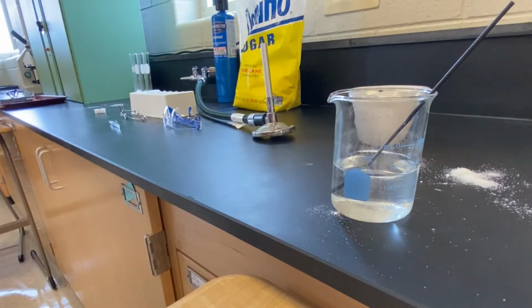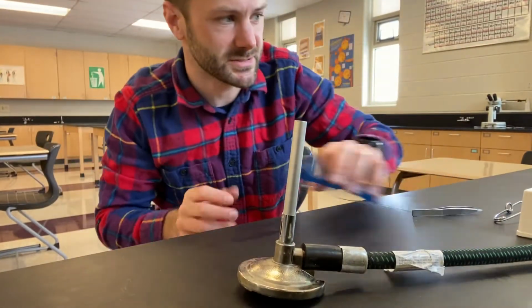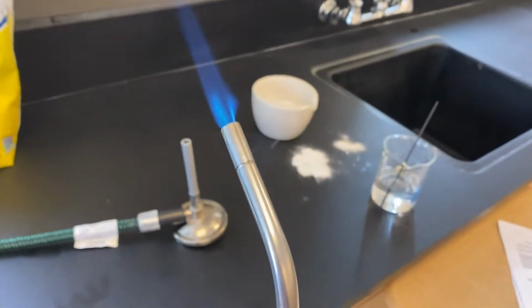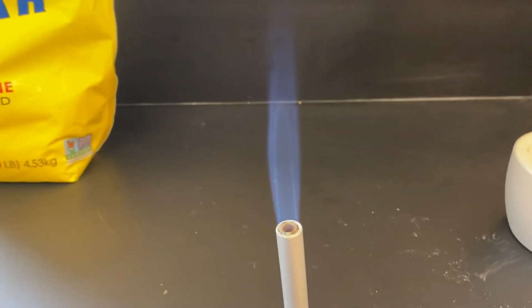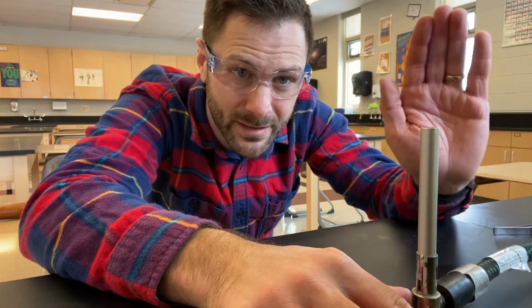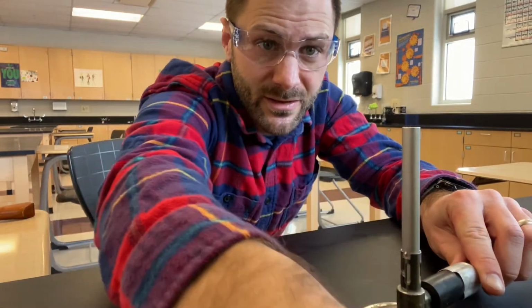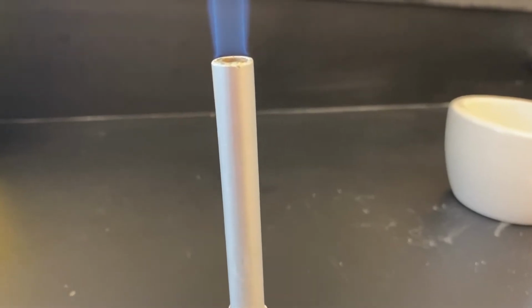Okay, now it's my favorite part of the lab, where we are going to light this Bunsen burner. So give me just a moment to do that. All right, now as you can maybe see, the flame here is very clean burning, okay? In fact, without a background, it's hard to see a flame at all, but there is a flame here. The color of the flame is blue. Let's see if I can turn this so you can see it. My shirt has too much blue on it, so it's not super great. But trust me, there is a flame there.